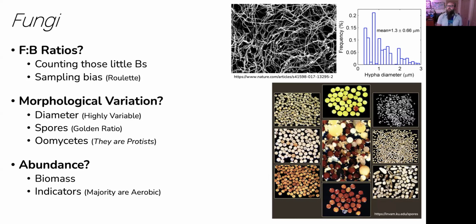isolate, one species of fungi, and they grew it in this interesting foam so they could get all these 3D cuts of it. And actually, some of the things that I have always thought, like larger diameter fungi are more beneficial to plants or whatever, it can also be the age of the fungi that they can appear quite small. Some of these hyphae came out at 2 to 3 micrometers in diameter, but the same exact species had a lot of examples of very thin diameter.